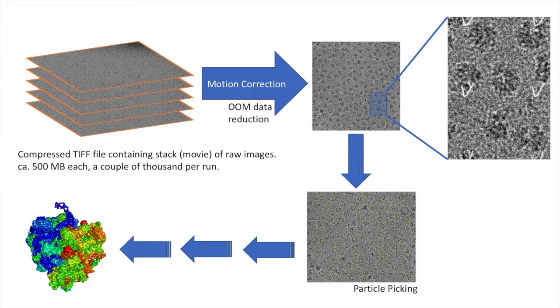And so you can imagine that if I have many, many duplicates of the same exact protein, and they're all spatially oriented in different ways, and I can see them from all different sides, I can then tell the computer, hey, here's a particle, here's a particle, here's a particle. I select the particles. Some of that's automated, some of it isn't. And I can then finally reconstitute a 3D structure of my protein.